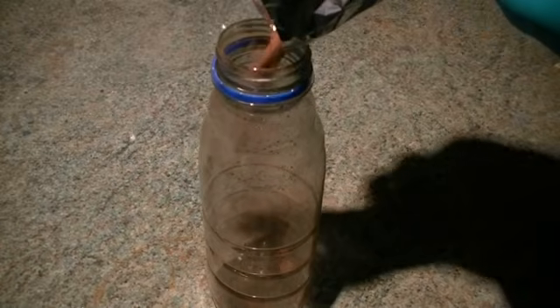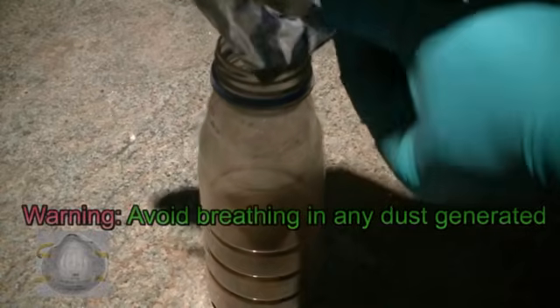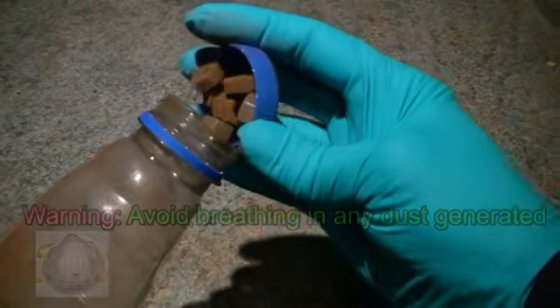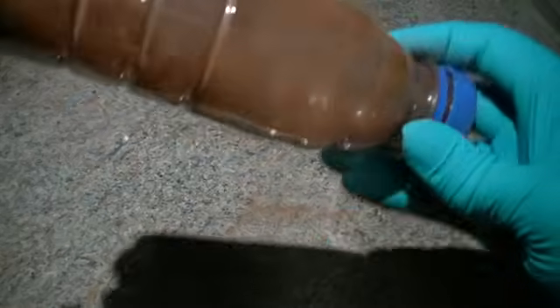To turn this clumped powder into a finer powder, one option is to use a homemade shatter box. To do this, we can use a plastic bottle, which we add our clumped powder in. To help break it into a finer powder, we can add some nuts. Just carefully screw the top on, and then we shake it. Now the nuts will impact the coarser powder, breaking it into a finer powder.